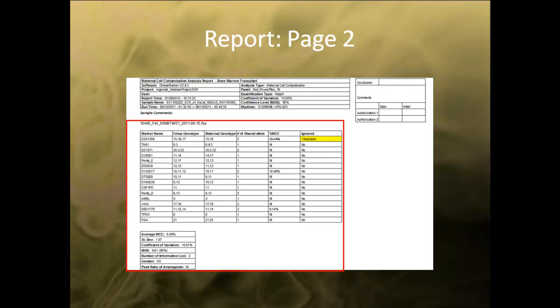The second page of the report contains the same header information and signature box as previously mentioned. The results table will display all markers unless specific markers are chosen. The MCC summary table shows the same information as the results window. Any markers that are ignored will be indicated in the ignore column as yes and highlighted in yellow.